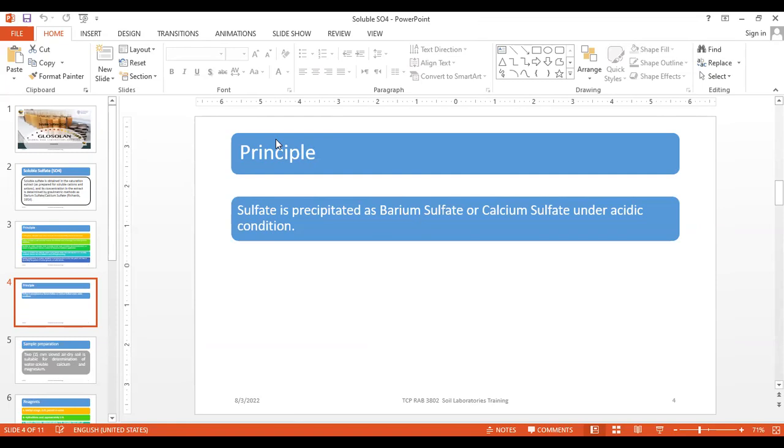I got a note from Maria that you use this in water, and as we discussed in our talk, the same principle is correct. Both of them are from water. For water you deal with water, and for soil at the end you deal with the water from soil saturation. So at the end, both of them are water. So the same procedure is followed.